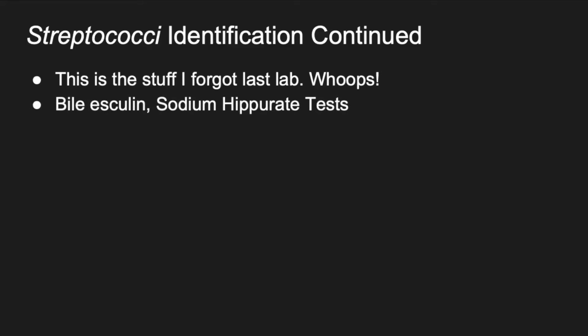You did both of the tests for this lab. We just weren't able to look at the results, and I wasn't able to tell you the importance of these two tests. So I'm going to do that now. The two tests that you guys did were the bile esculin and the sodium hippurate tests.